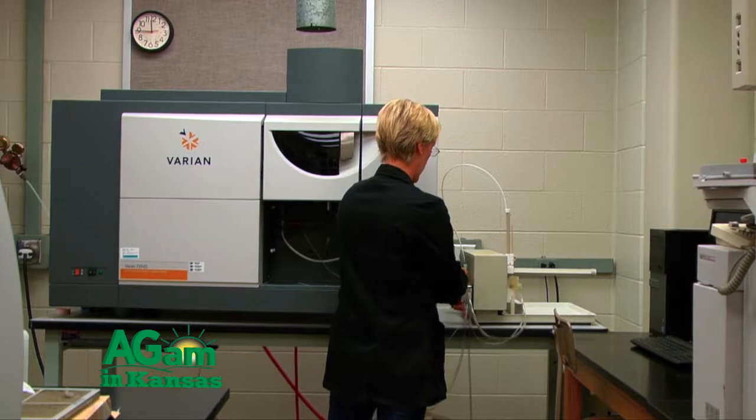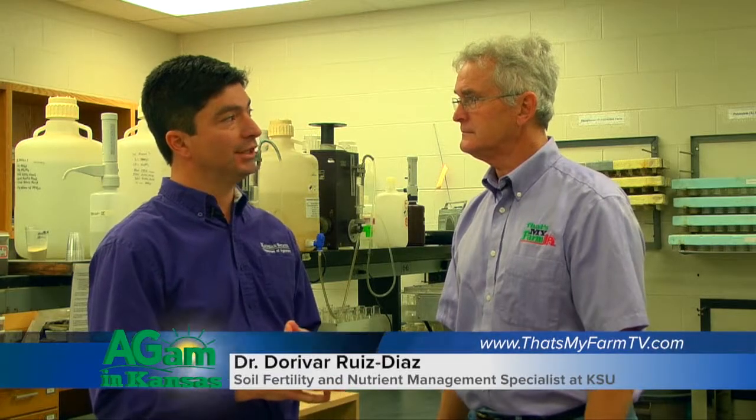Absolutely, and that's a very important question, Jim. We get that question very often from producers: is the number I'm getting good enough to make that decision? Because the decision we are making is going to have significant economic implications. So there's really two components to that, Jim. One of them is what happens in the field, how we are collecting those samples. That's going to be a key first step.